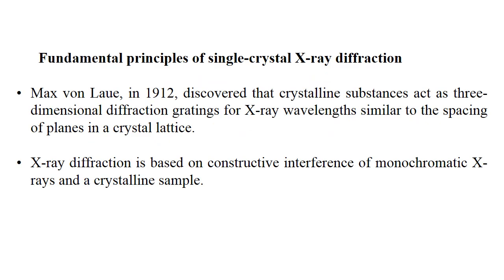The fundamental principles of single crystal X-ray diffraction. Max von Laue in 1912 discovered that crystalline substances act as three-dimensional diffraction gratings for X-rays, with wavelengths similar to the spacings of planes in a crystal lattice.